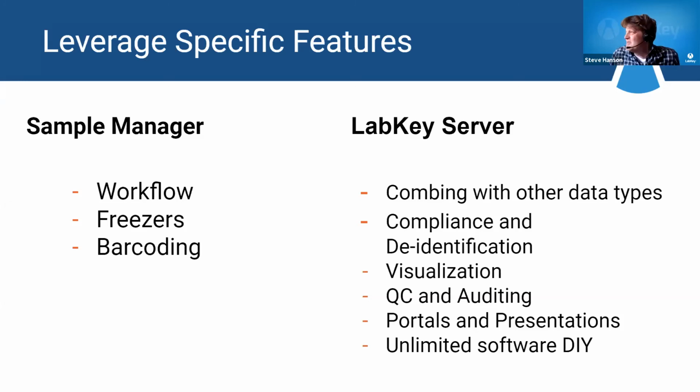Well, you might be asking yourself, how are Sample Manager and LabKey Server related? Like, what do they have to do with one another? And the answer is they're really the same thing. At least they're based in the same thing. Sample Manager is really just a selected toolkit out of the larger toolkit, which is LabKey Server.